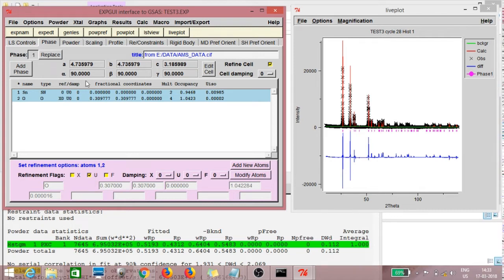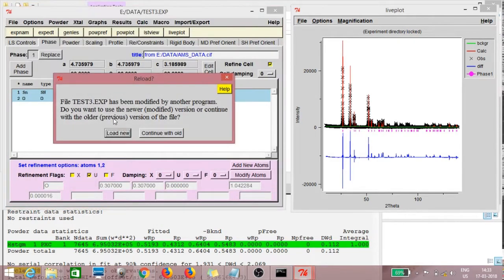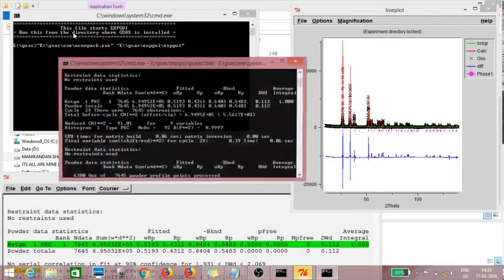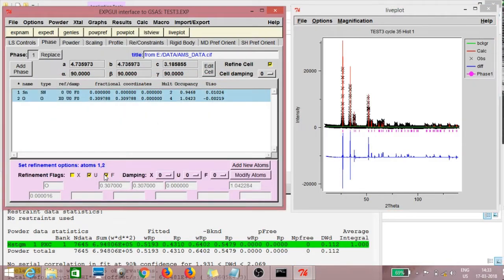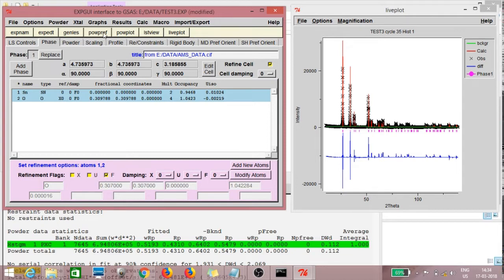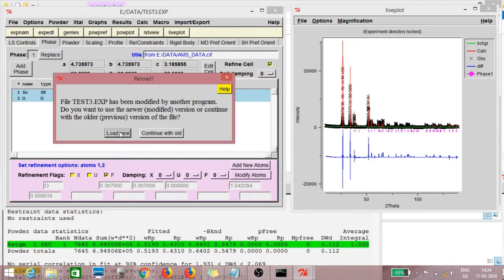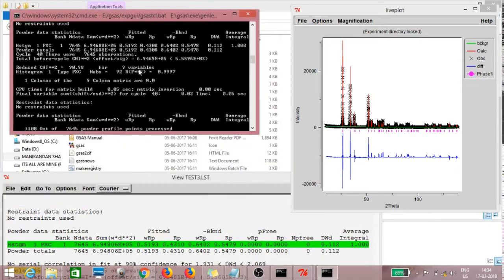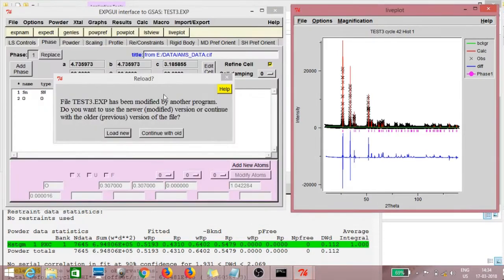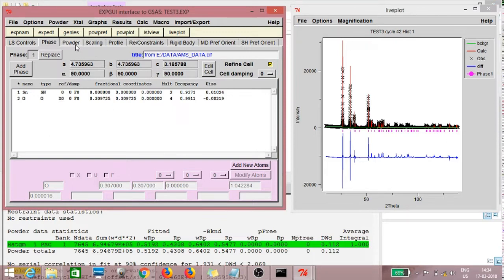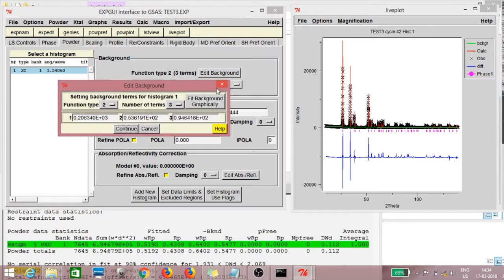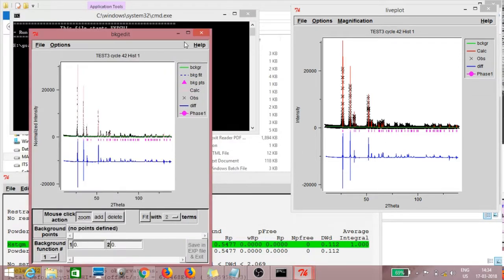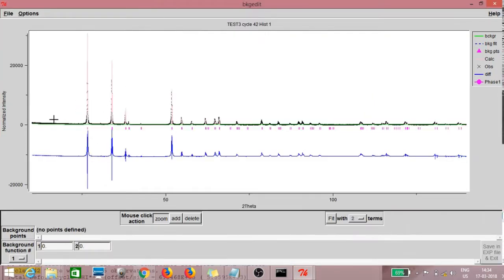Then, once again U1. MB. TX. Like F. 4308. Now I am going to the powder and edit background. Fit background graphically, then zoom the background.